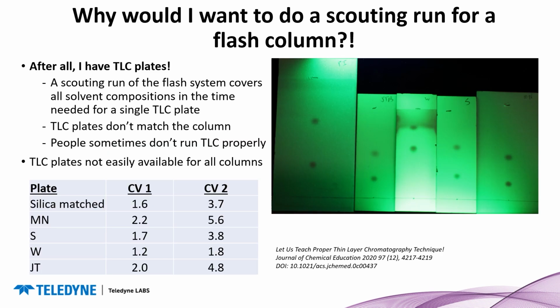So why would I want to do a scouting run for a flash column? It's a silica column and I have silica TLC plates. Well, here are some runs from different TLC plates. All of the plates were run correctly according to the reference on this page. Yet all gave different calculated retention times.